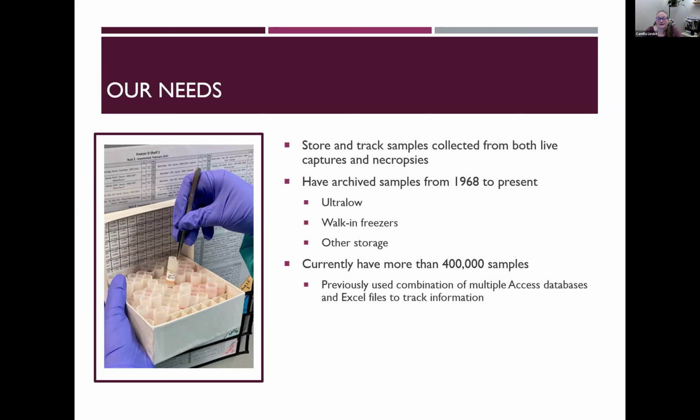Because all of those different sample types or programs are going to have different requirements for what we need to track. We also have a large number of Excel files, and of course, the issue we have with those is that over the years they can get corrupted. They can have errors introduced into them, and then we have to go back to old backup copies and recreate what we have done over a time period once we discover those errors, and it becomes very cumbersome and very time consuming.